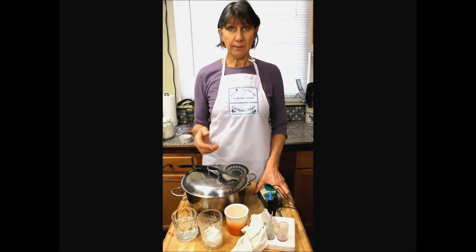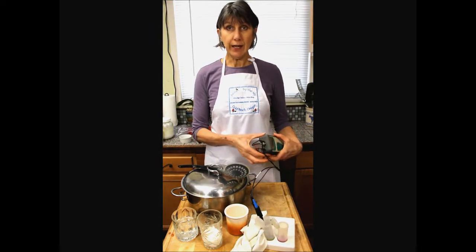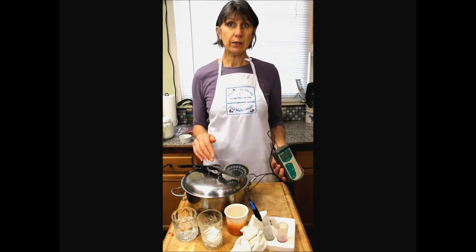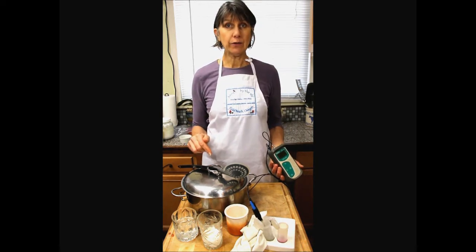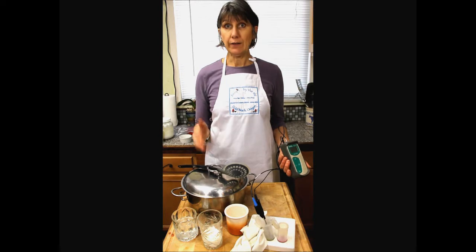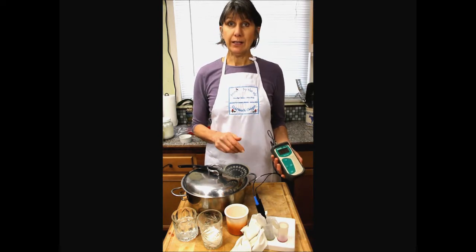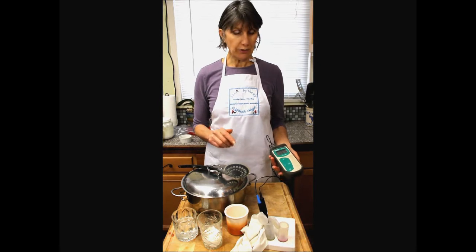Today we're going to talk about pH, specifically how to use a pH meter for your cheese making. Whether you're a home cheesemaker, an avid hobbyist, or a commercial cheesemaker, it's all the same importance. pH will answer many of the questions you're going to have about your cheese making as you go along.